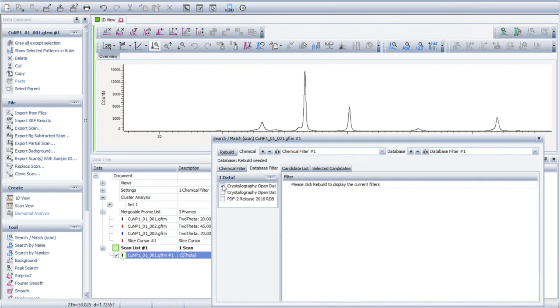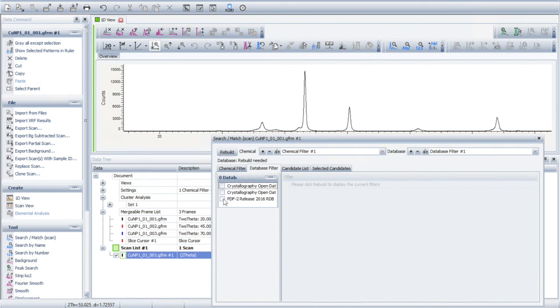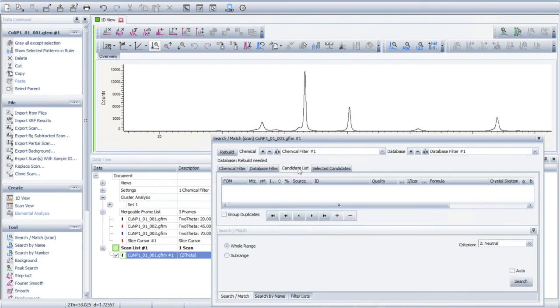Crystallography, open database. This is entered twice, but we only need once. And, right now, we're using PDF-2, which is a paid program. And go over here, candidate. And we do the search. We use the whole range.